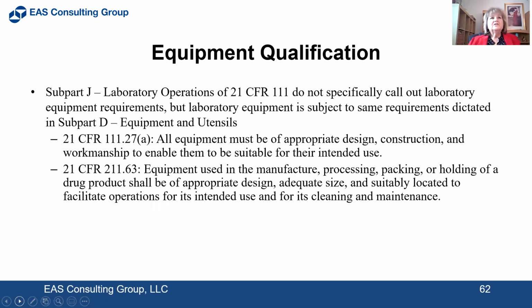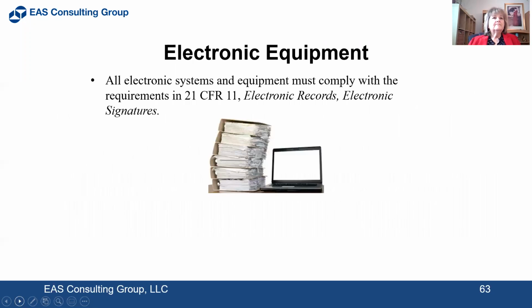It's required that your equipment is qualified. Here are the 111 and 211 references for that. If you have electronic equipment, it must comply with 21 CFR Part 11, which is electronic records and electronic signatures.